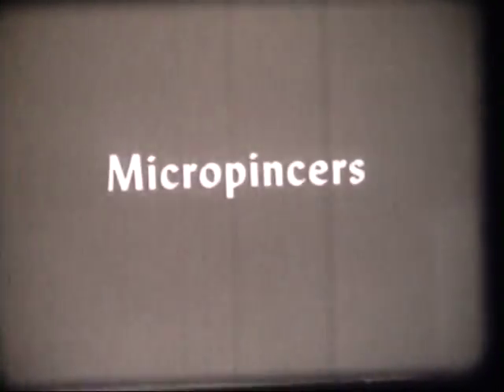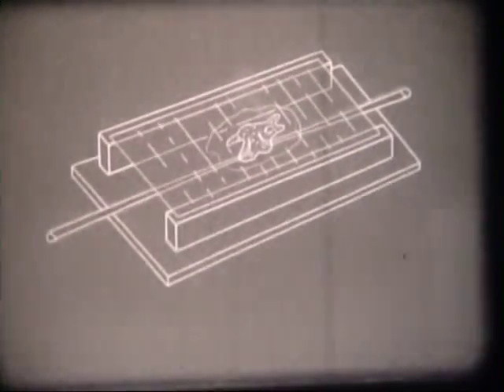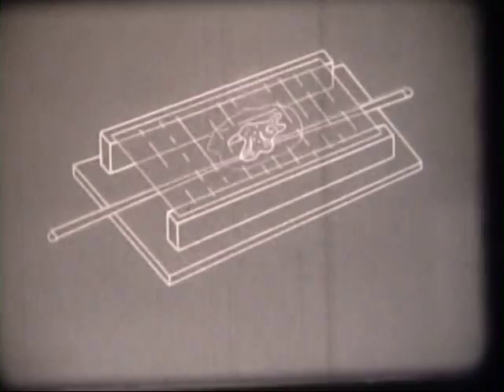And now let us compare this microdissection needle with a good new sewing needle. We have all sorts of instruments for microdissection. Here is a double needle holder used as forceps. But we must get to work and tear the protoplasm to see if it holds together, or if it is simply a fluid like water. And for this purpose, we need a culture on a microscope slide, which becomes the roof of a small moist chamber with open ends, with the protoplasm on the inside.